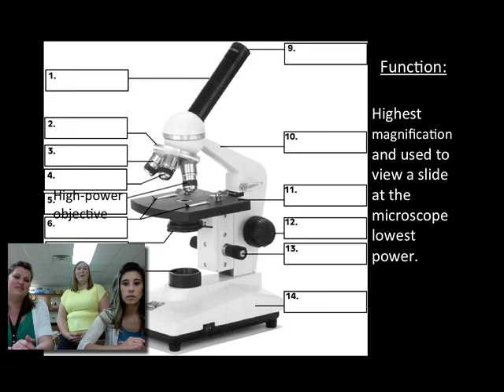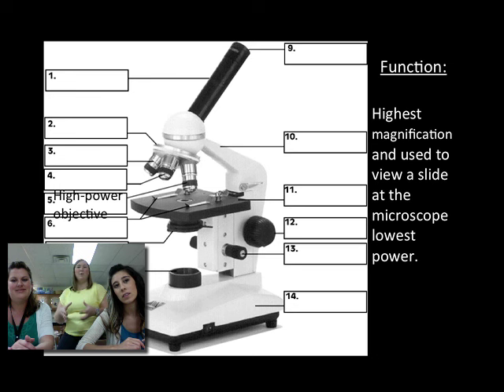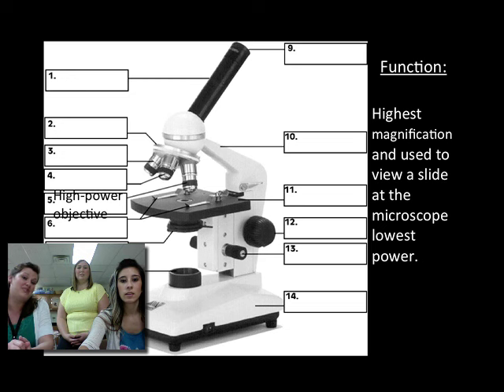The high power objective is the highest power we have, except in AP where we've got one more that's a little bit higher. For most of the microscopes we have, this is the highest power. This is where you can focus in or zoom in the most on an object, but it's also the hardest to use and focus properly on. Be very careful not to break the slide by pushing the high power too far if you're too close to the stage.